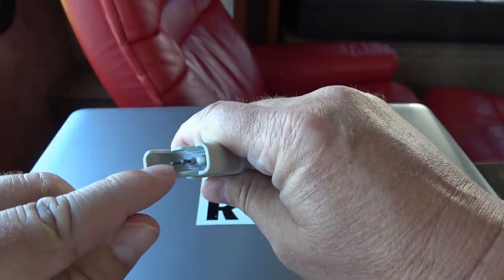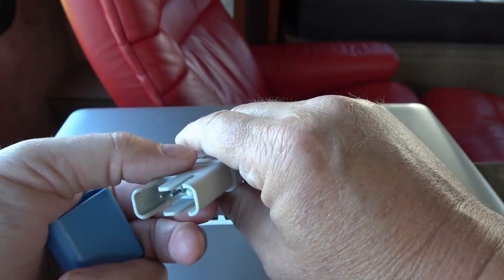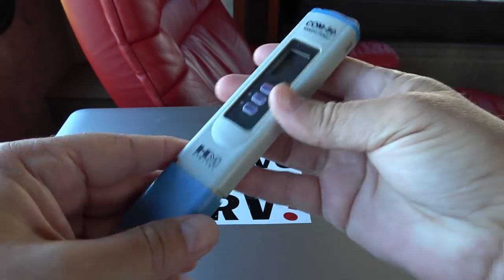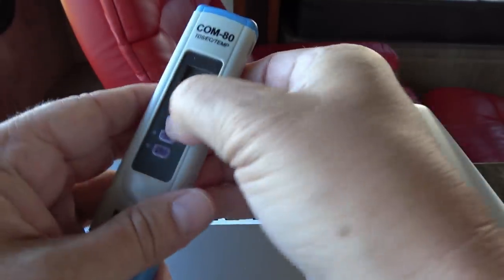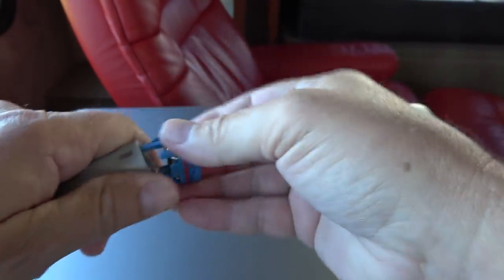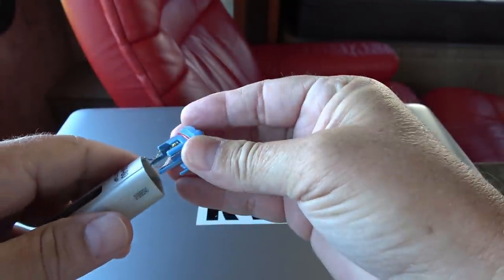What it's doing is sending a little bit of electrical current through the water, and by how conductive it is, it can tell how many solids are in there — like salts and iron, that sort of thing. For batteries, up here it came with batteries. The top pulls off and we have just three little button-type watch batteries in the top.